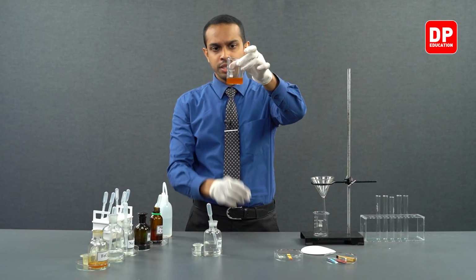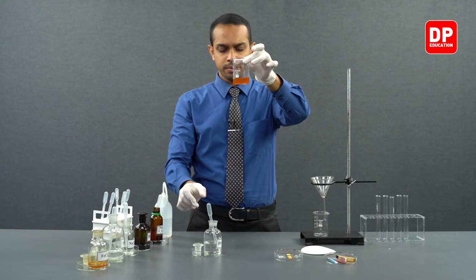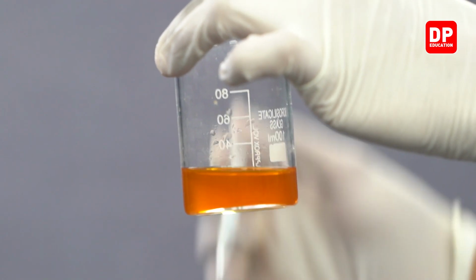We still cannot see a precipitate, so let's add a few more drops.